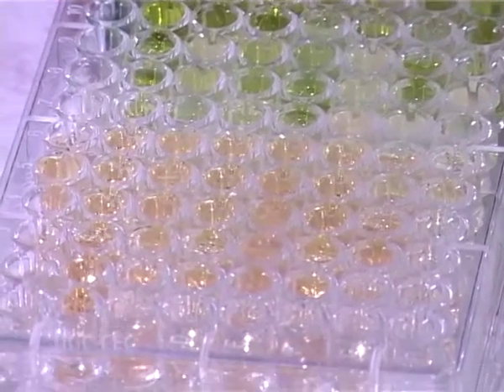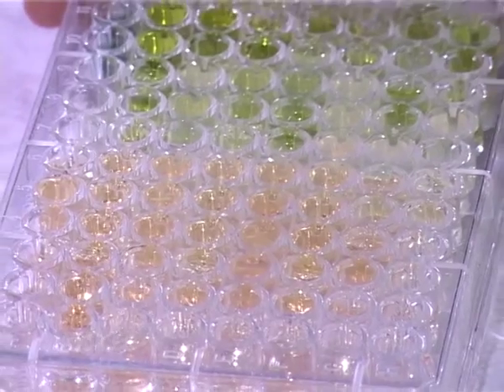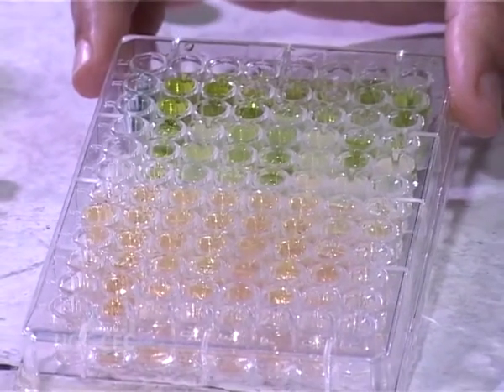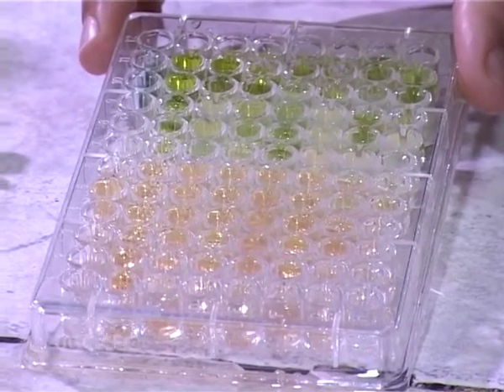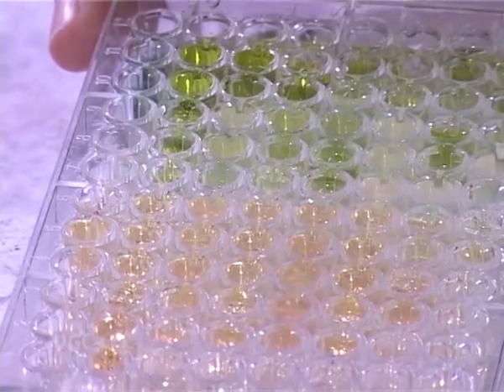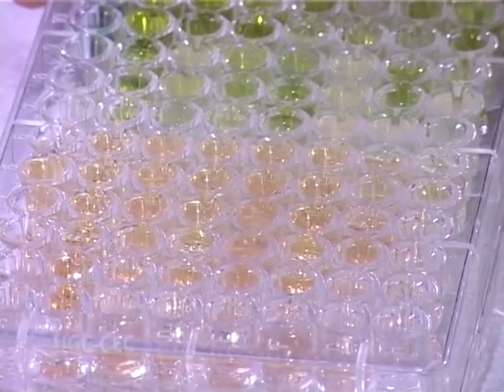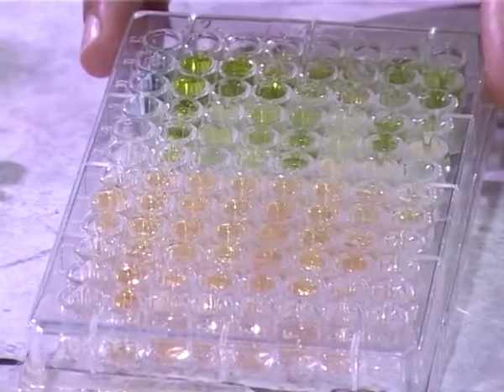Okay. Now color intensity is measured in an ELISA reader. The extent of intensity depends on the amount of antigen present in a well. These wells looking white mean no antigen is present in this well, whereas these wells contain less antigen, and these wells with intense dark color mean the amount of antigen is more in these wells.